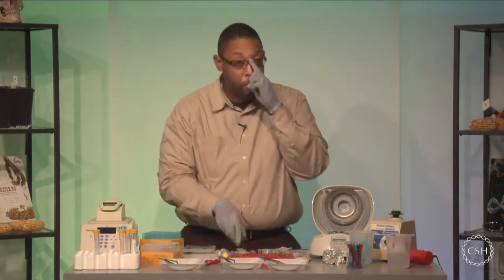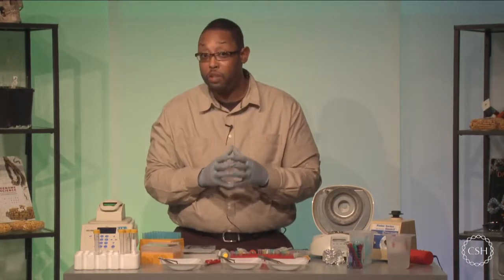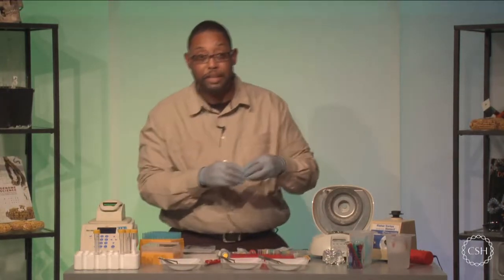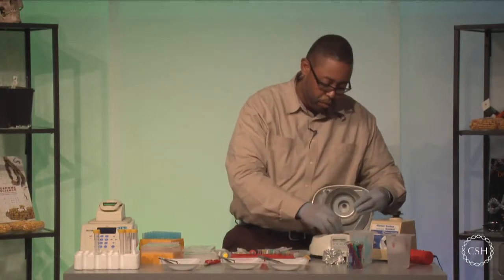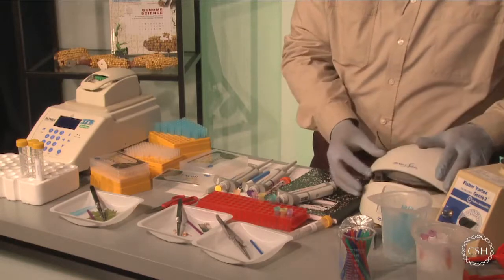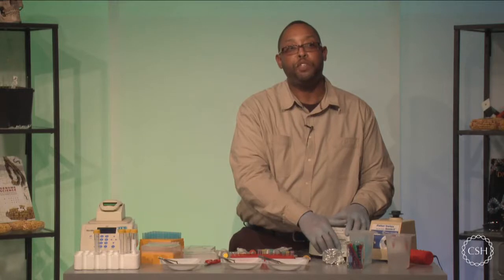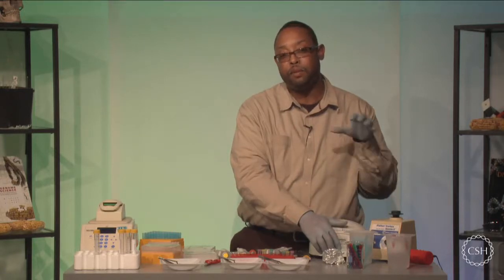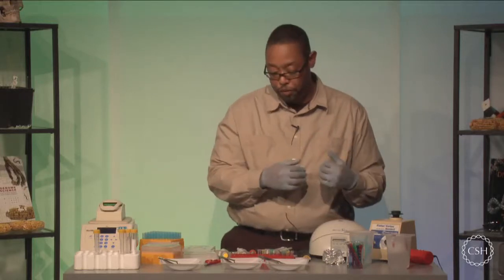Okay, now one of the things I mentioned is that we have to make sure we get all the alcohol, or all the wash buffer, physically off, because we want to elute the DNA next. So what I'm going to do is place these back into the centrifuge one additional time, and give them a brief spin. This brief spin is going to allow me to get the remaining portion of liquid back to the bottom of the test tube so that I can remove that material.